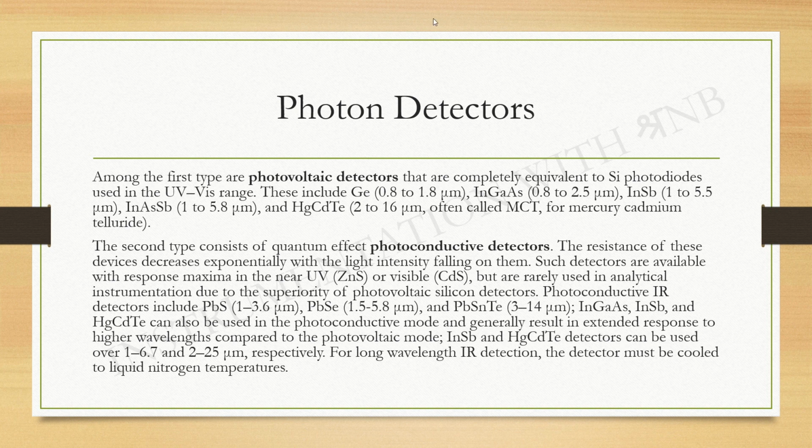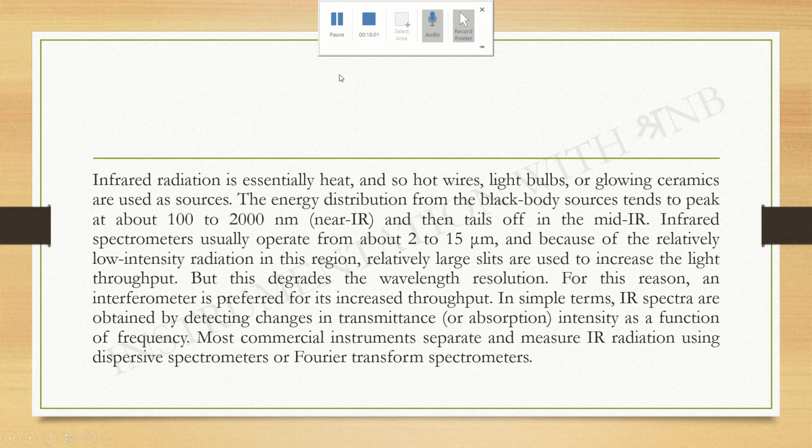As I have discussed earlier, the source of infrared radiation is basically dependent upon heat, hot wires, hot bulbs are used.